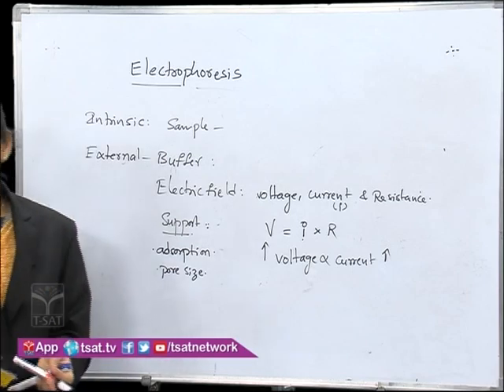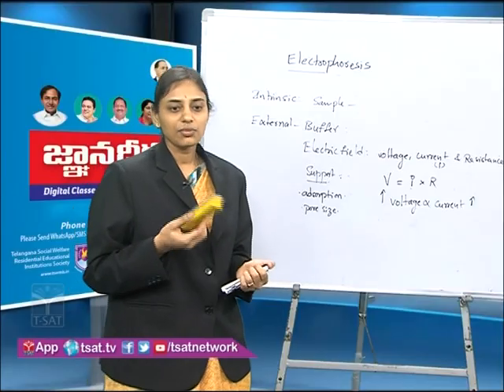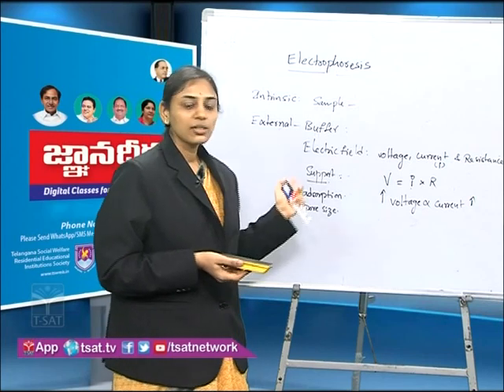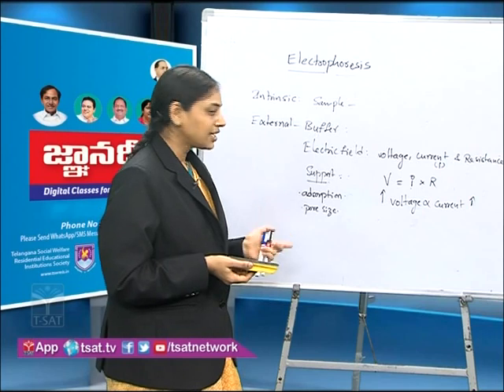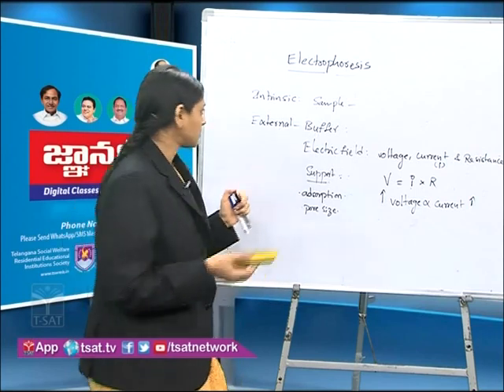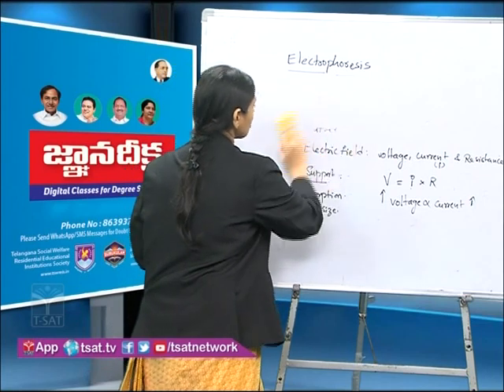So, these are the factors influencing electrophoresis. Whenever we are running the electrophoretic system, we need to take care that these factors should be kept constant, in order to get the maximum migration speed and better resolution.